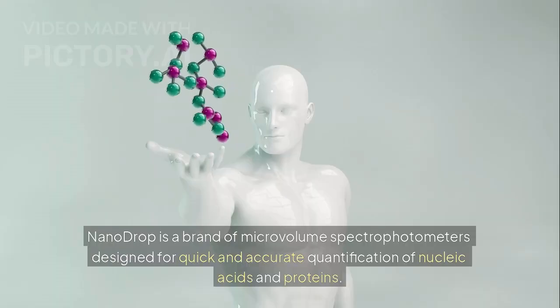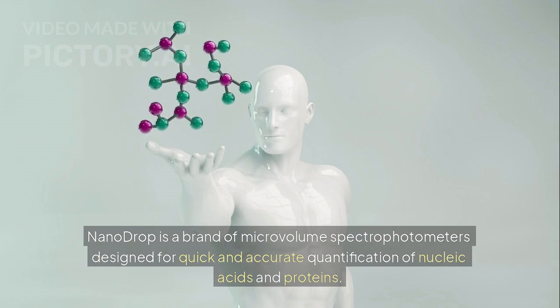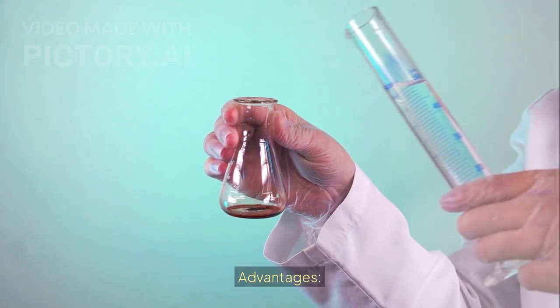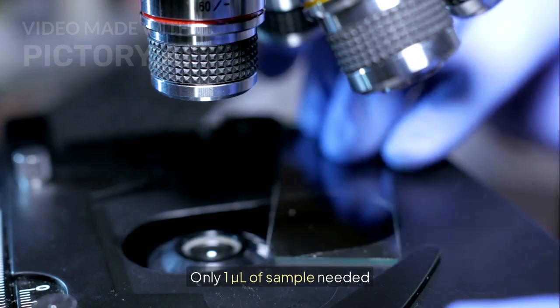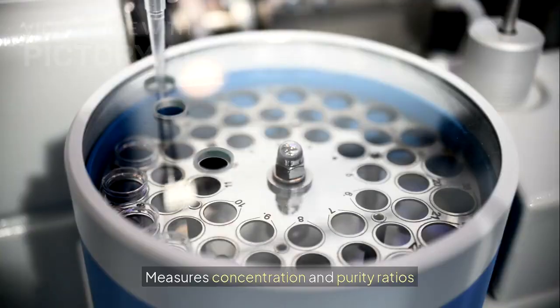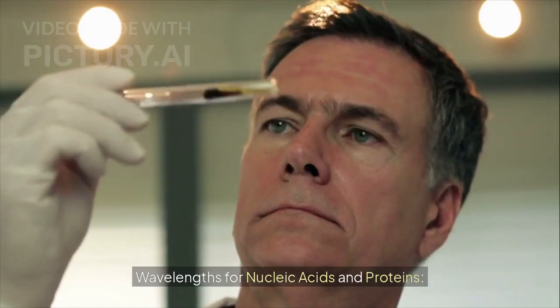NanoDrop overview. NanoDrop is a brand of micro-volume spectrophotometers designed for quick and accurate quantification of nucleic acids and proteins. Advantages: only 1 microliter of sample needed, no dilutions required, fast results within seconds. Measures concentration and purity ratios.